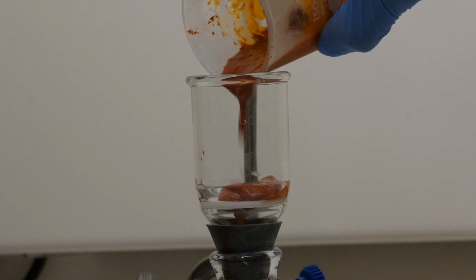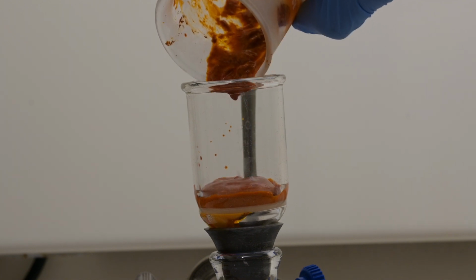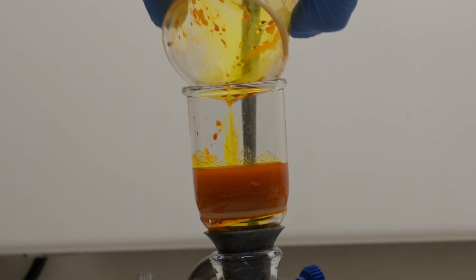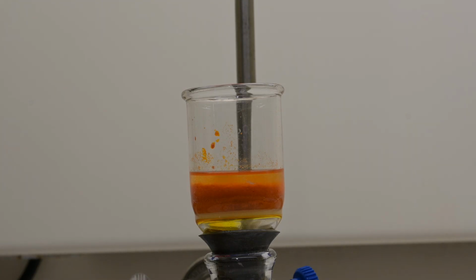Once cool, I transfer it to a glass fritted filter to remove any liquid, using some cold ethanol to aid in the transfer. The ethanol was also washed through the methyl orange a few times. After the ethanol washes, diethyl ether is passed through until it runs clear. I left the pump running for a while to pull air through to dry the orange dye completely.